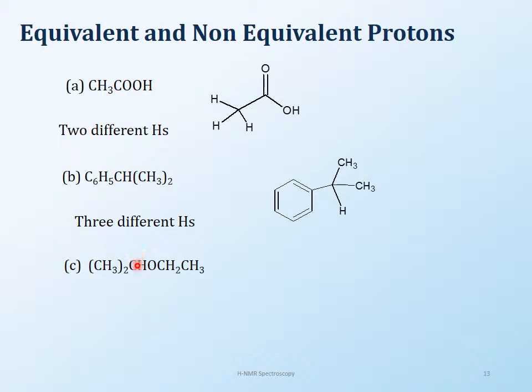Okay, one more. So here's a compound. Now when you see something like this, it would be best if you draw the structure, because then you can clearly see what the protons will be like, and you don't have to draw all the hydrogens out if you don't want to. At least draw a line structure so you can clearly see what the bonding is like.